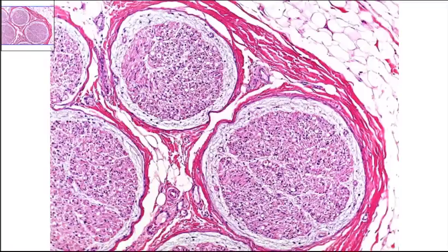This slide is a cross-section through a nerve. You're currently only seeing a portion of the entire nerve. The current magnification is 100x total magnification. What we're looking for is going to be the features of a nerve, what's inside of it, and what are the different layers of connective tissue.